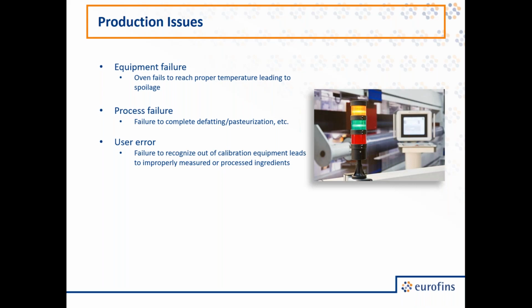However, this can also be a wide variety of other issues. For example, you could have a user accidentally add twice as much of an ingredient as they were supposed to, or perhaps forget an ingredient. Now your flavor profile is off. This can also relate back to contamination.